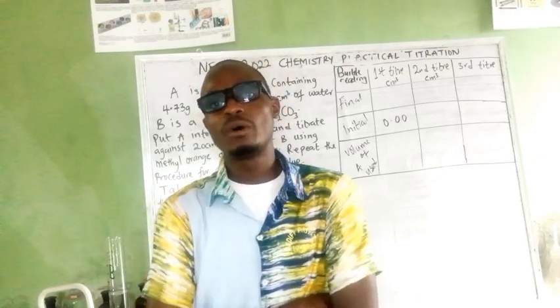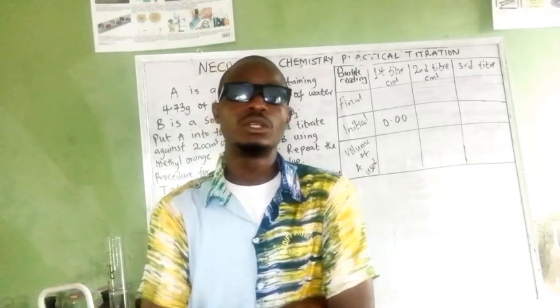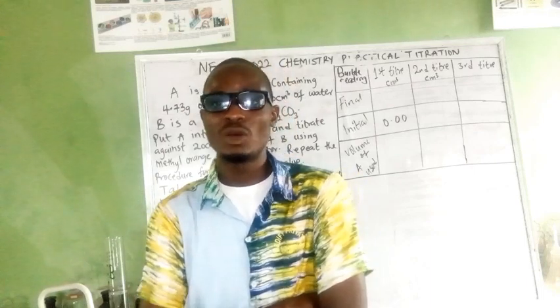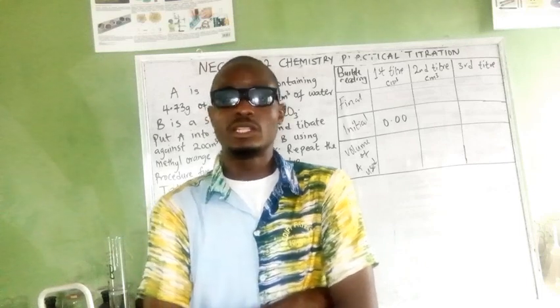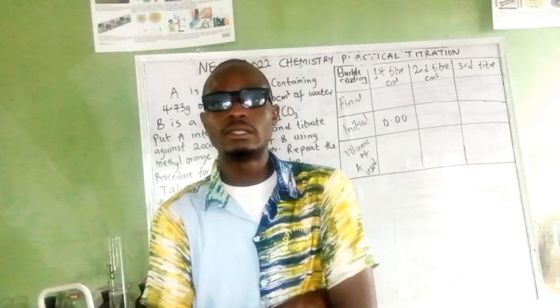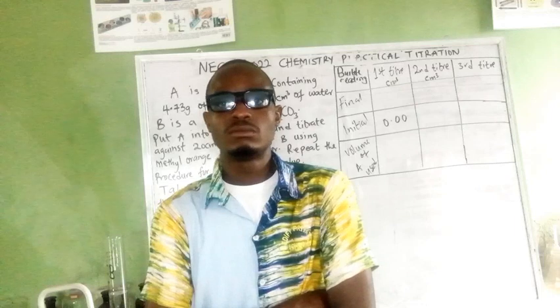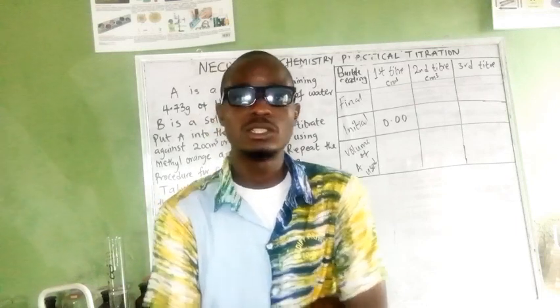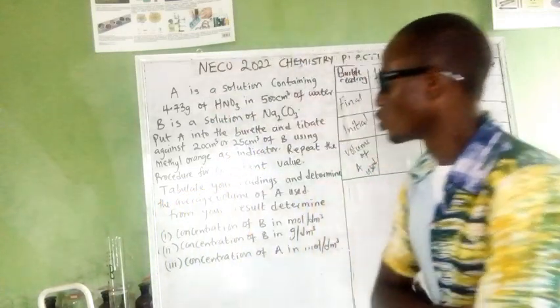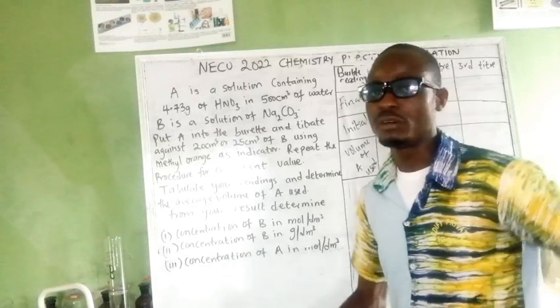In this video, we'll talk about the NECO 2022 chemistry practical titration. So we want to look at the likely question, and possibly that would prepare us very well ahead of the exam. So I'm going to show the question now, and then we go over doing the practical, so then we get on to things that would help us massively in the exam. So let's look at the question. Let's go through the question like we used to do in every one of our videos.